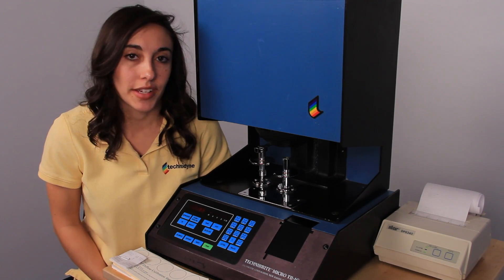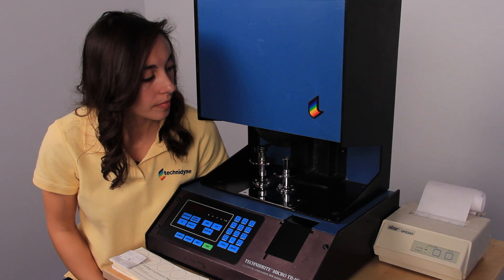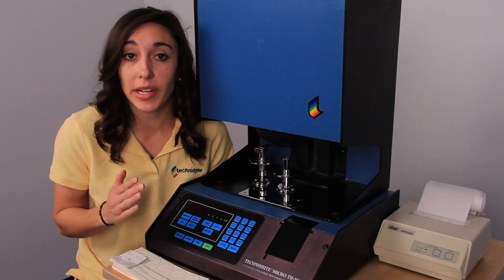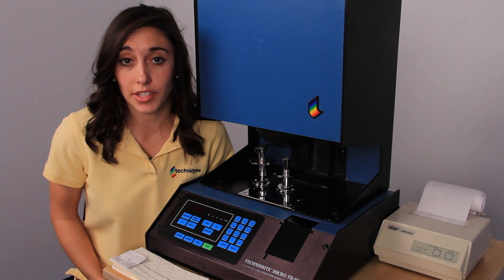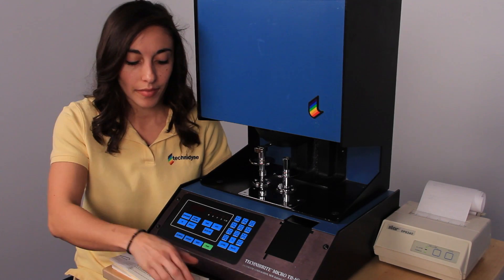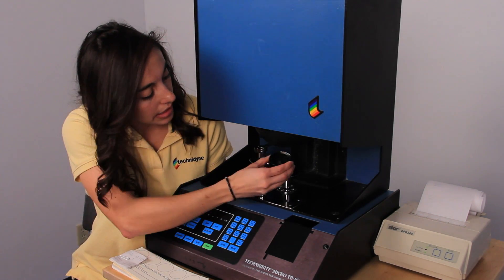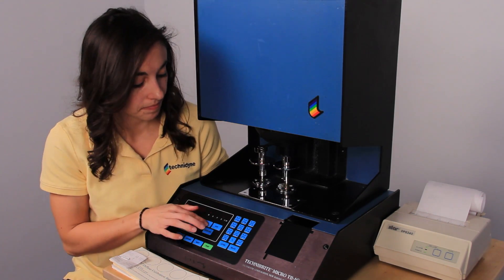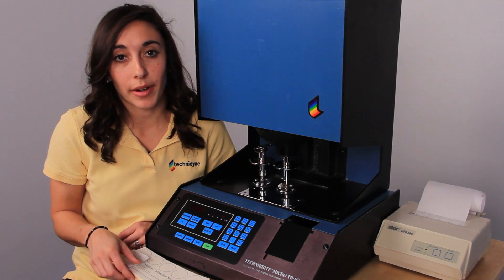Our first step is to press calibrate. One of the great things about this instrument is that the printout is going to essentially give us step-by-step directions throughout the entire calibration. The first thing it's asking us to do is to load the black cup. After we make sure that there's no contaminants on the inside, we can load that and press scan.